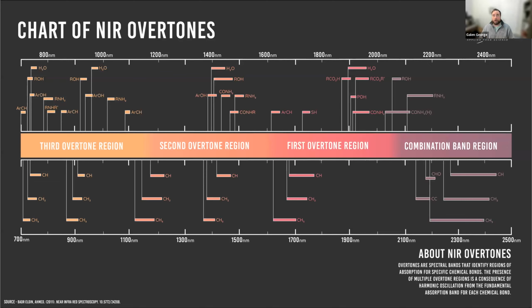So those are the first two steps, right? We're pre-processing our spectra, and then we're selecting wavelengths. In many cases, we're just selecting the full wavelength range of our instrument. Or just the full wavelength range of the NIR, or just the full wavelength range of the visible light, whatever it is that you're trying to accomplish. And so now we're at the stage where we know we want to do these things ahead of building the model. And then we want to now select which model type is going to be best for us.